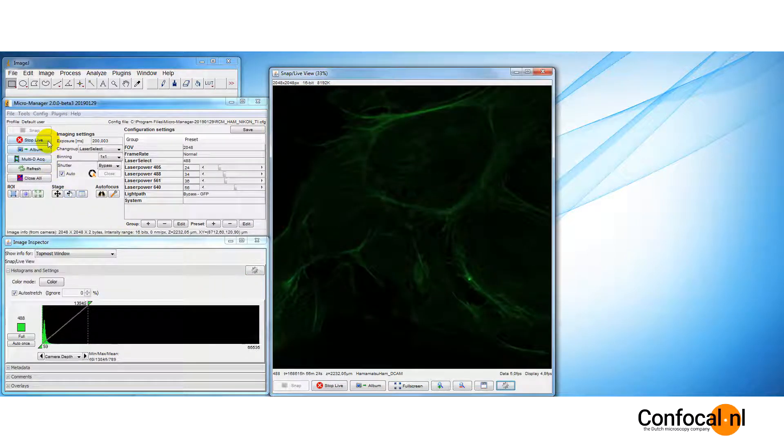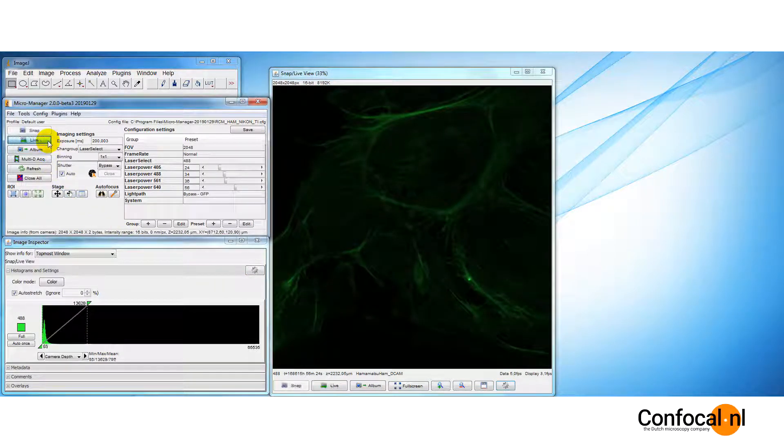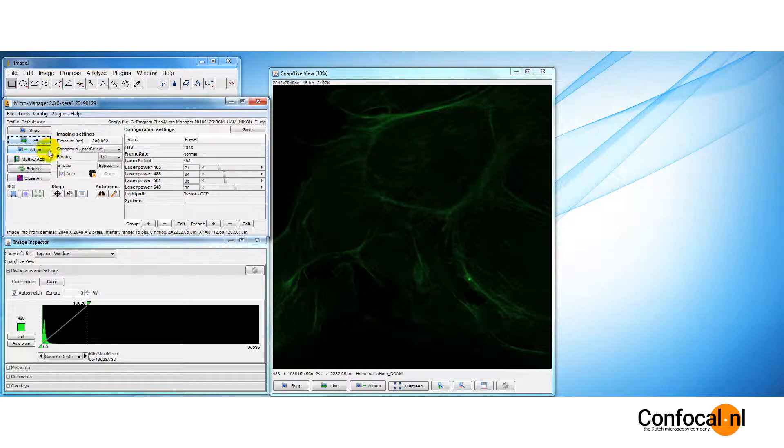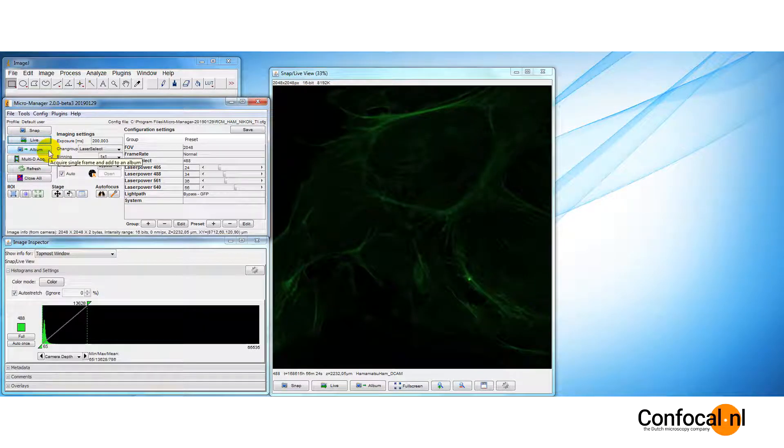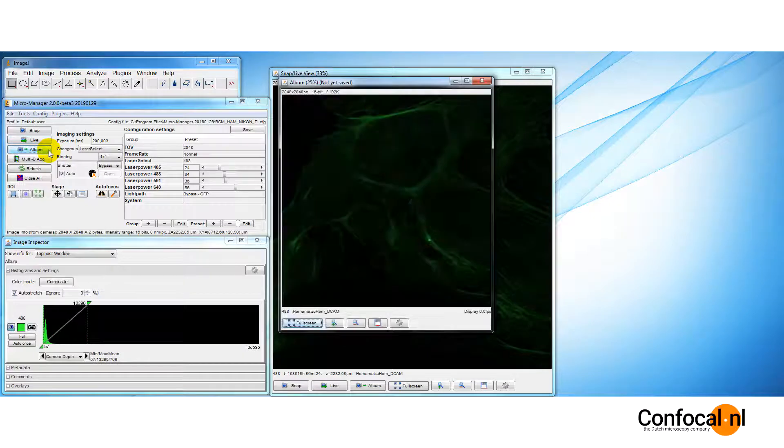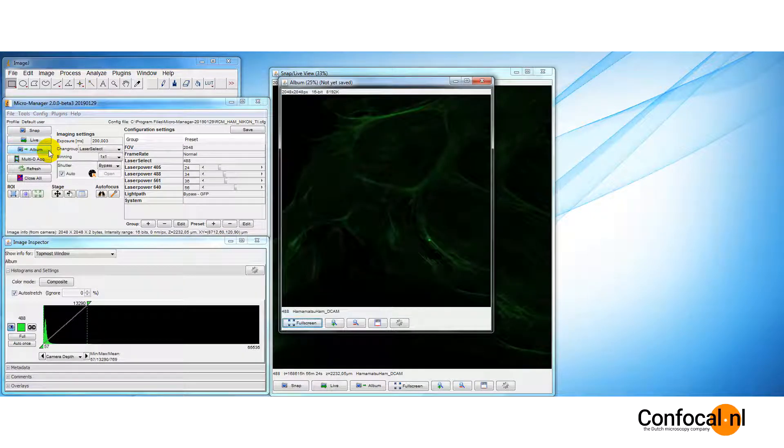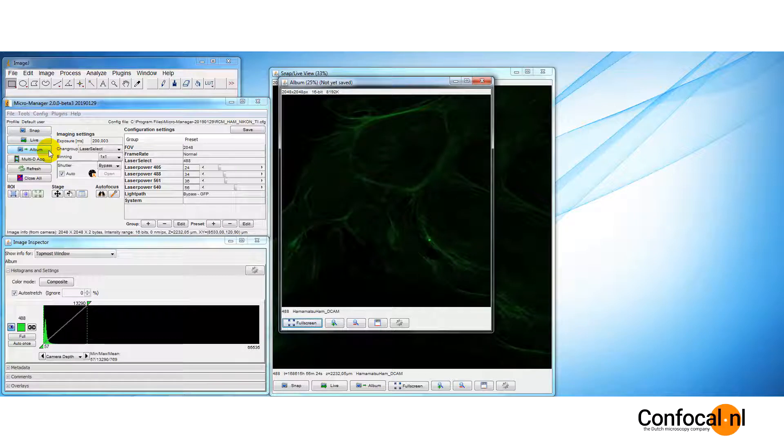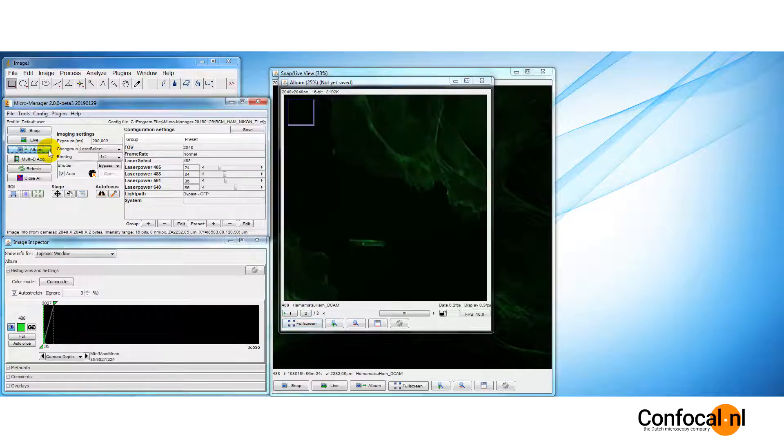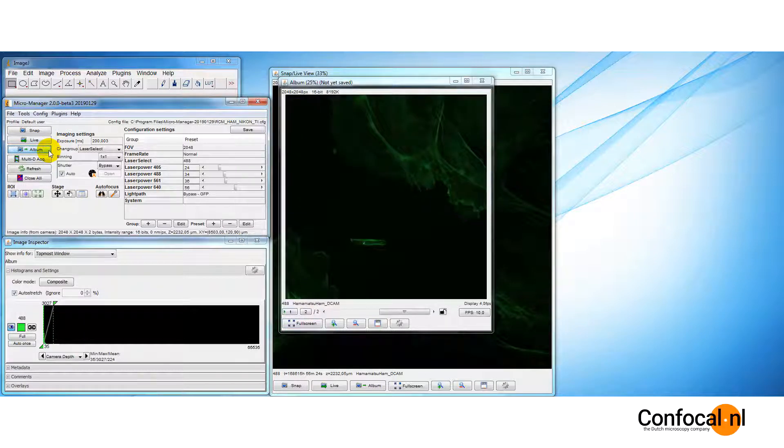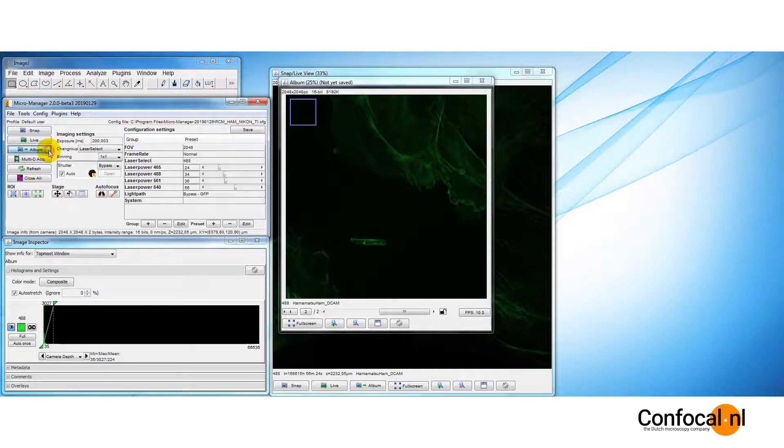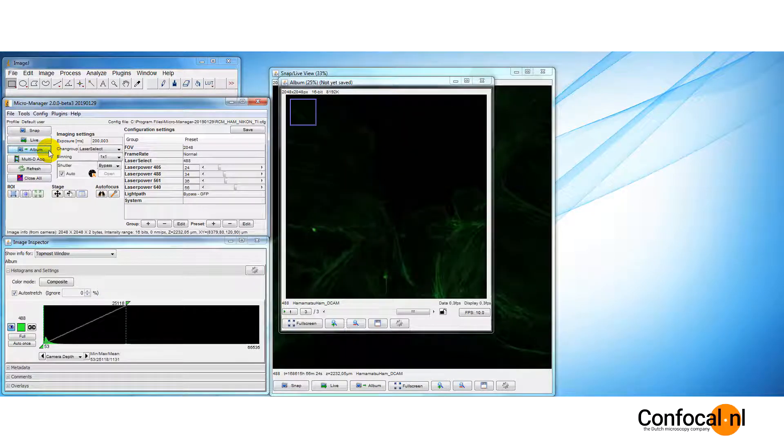With the Album button, you can collect a series of still images in an image series window. The first time you click the Album button, a new series window will open, with a fresh image obtained from the camera. Every time you click the Album button thereafter, a new image will be added to the series.